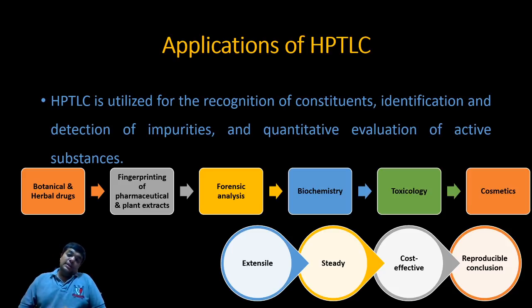I hope going through this whole package of HPTLC has made your mind very clear that HPTLC is really an advanced version of TLC, and the P over here only stands for performance. We have tried to prove that yes, it is definitely performing well compared to TLC.